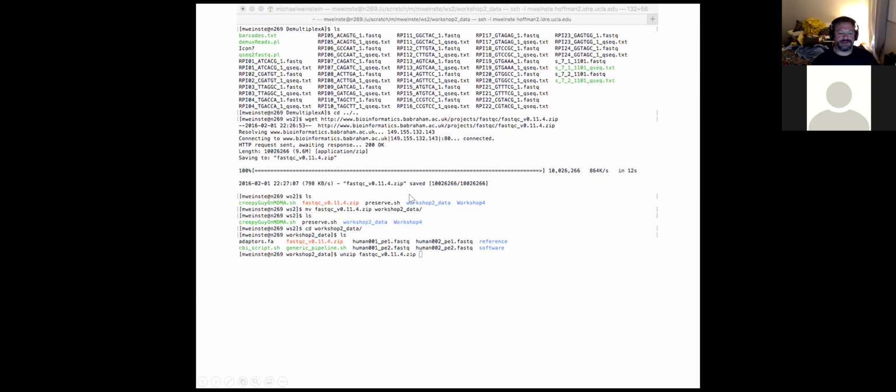All right, so once you're in your WS2 folder, you're going to use the command wget, and wget is how your program gets some resource off the internet. So it'll be wget and then space, and then you'll paste in that web address we just got, and double check to make sure the web address ends with .zip. If the web address ends with .dmg, you accidentally copied the Mac version, so you'll need to go back and replace it. Don't try to copy what's on here. Number one, it's long and complicated and you'll probably make a typo. And number two, this is a version that's actually a little bit older. Yes, CD Workshop 2 and then CD WS2.